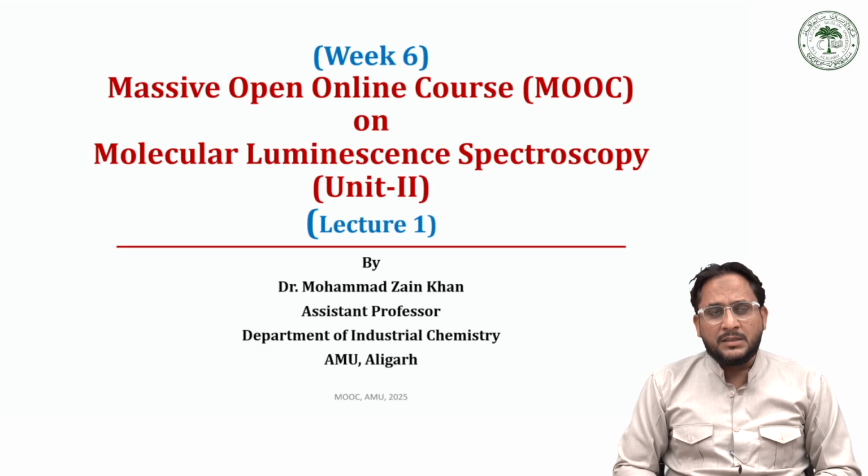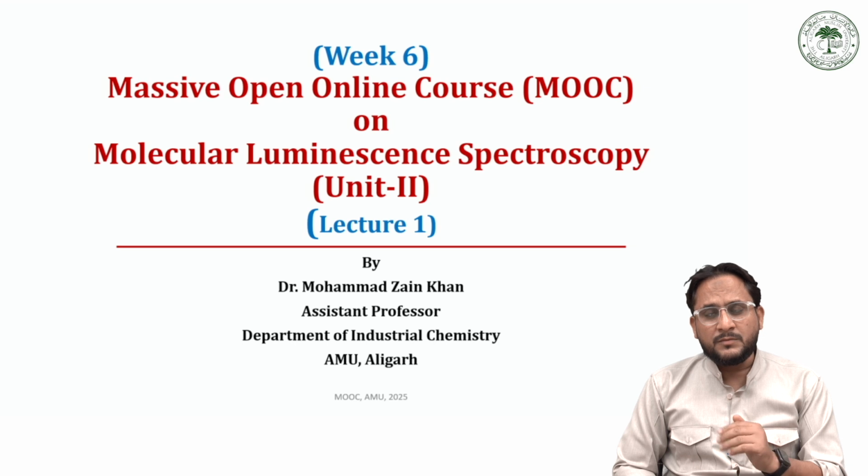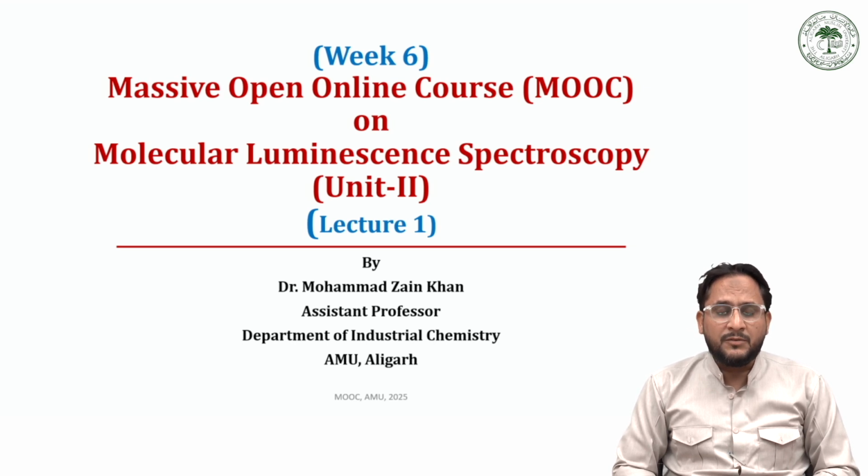In the last class, I explained the instrumentation of fluorescence spectroscopy. We discussed the various components of spectrophotometers. Those components include the light source, the monochromators, and the photodetector. Actually, there are two monochromators used, one before the sample tube, and then one more after the sample tube, and finally we have a photodetector followed by an amplifier and output device.